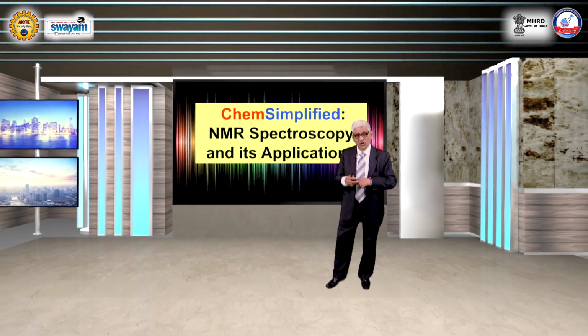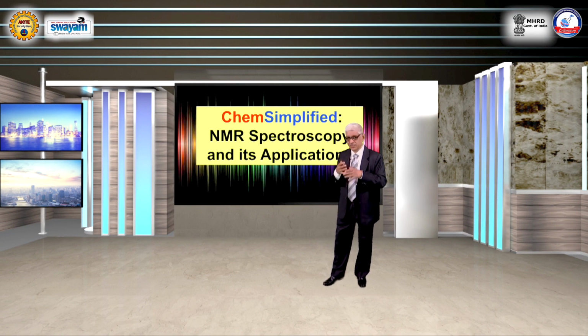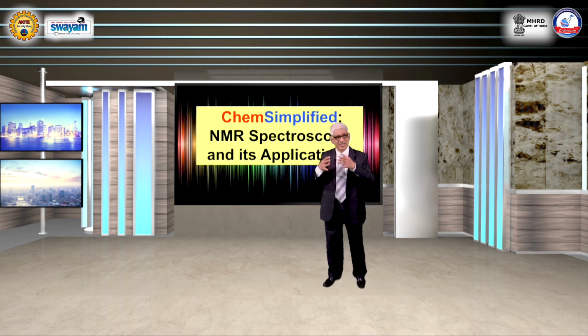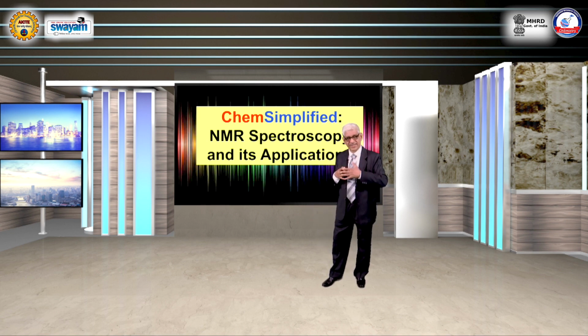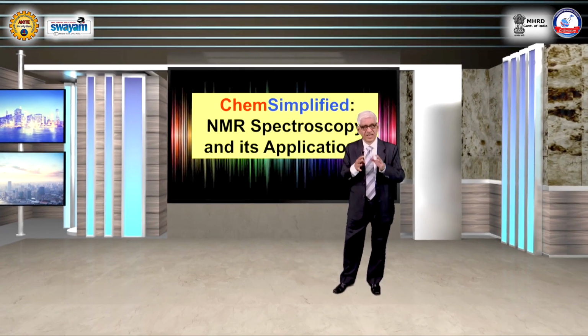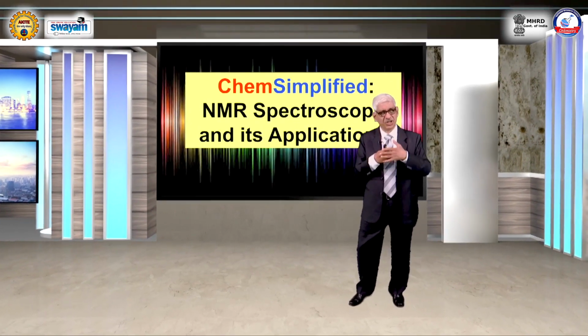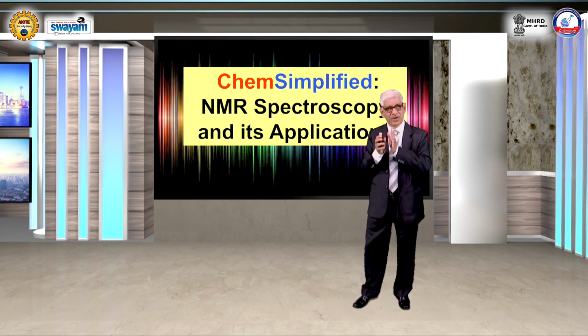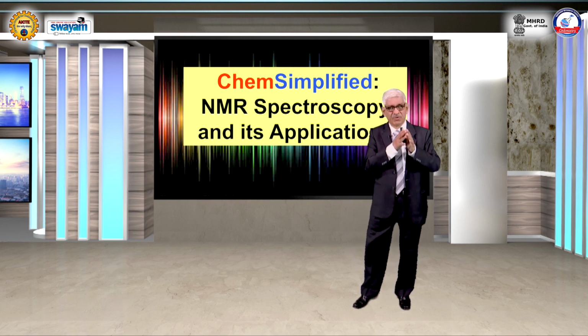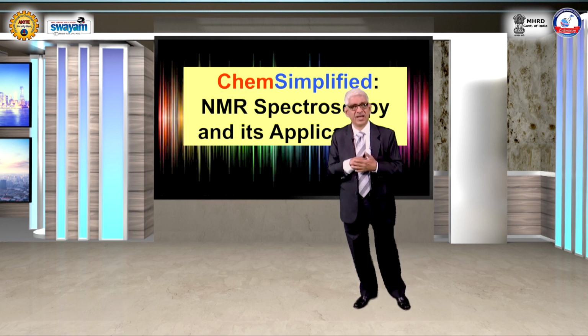And because of that, one could improve the resolution in your spectrum, display the information present in your spectrum into two dimensions, and then of course all those correlations which are present between the various protons in your molecule can be separated. You can put them along the two different axes. You have more possibilities of display of information. Therefore, you can separate the interactions between the protons in an appropriate manner. This resulted in J-resolved spectroscopy, wherein you can actually have coupling information along one side and the chemical shift information along the other side. So this was a kind of broadband homonuclear decoupled NMR spectra.